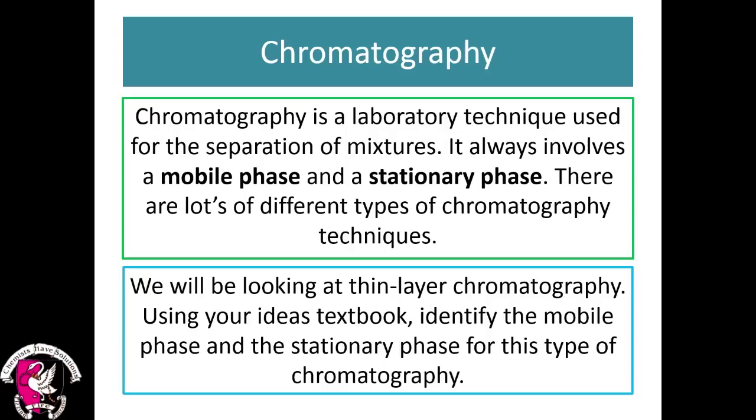So chromatography is an analytical technique, but there are different types of it. Okay, so there's not just one type of chromatography. There's different types that we will look at. But today we're just looking at the one. So we're looking at the thin layer chromatography.